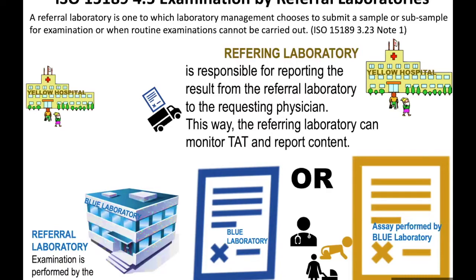Number two, the information on the results is what you want or what you expect to see. Number three, that all other information is present and there are no errors in that report before you send it out to your user. It is also your job to make sure that you follow up, and we'll be looking at this in subsequent activities, to make sure that that result is sent back to you on time.